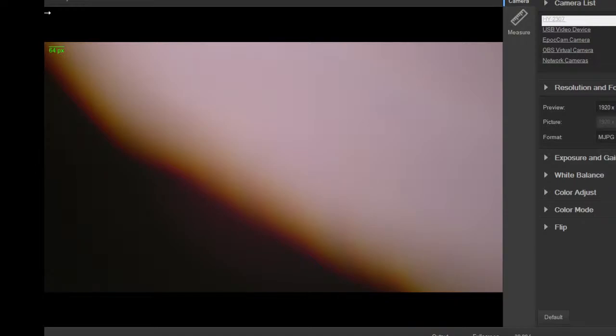Okay, so that's it for that slide. That was pretty good. Let me make another one off that same batch. So far, so good. Then I have some stuff from the kitchen to look at. It's always fun to look at items from the kitchen. Some people like critters, some people like kitchen food stuff, so it's good to mix it up a bit. See what's what. Alright, let's see if that finds anything good.